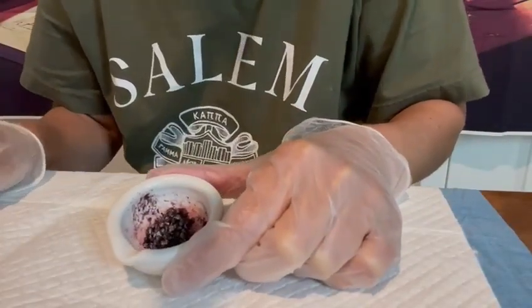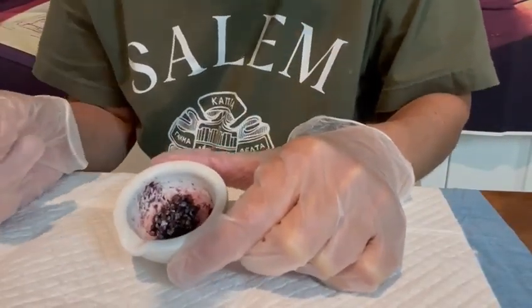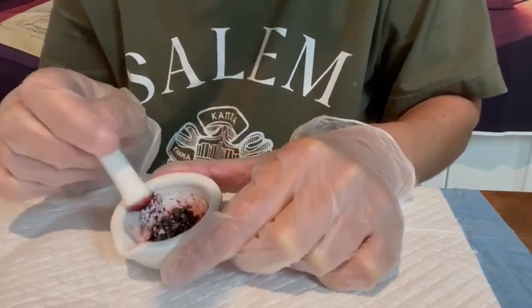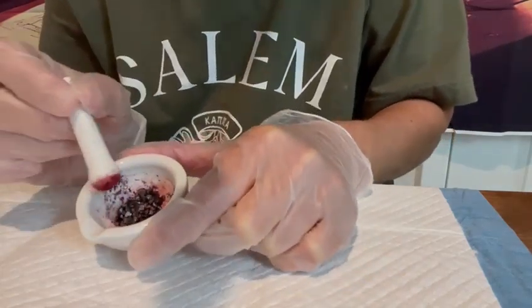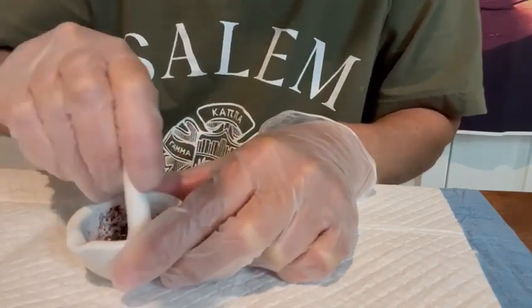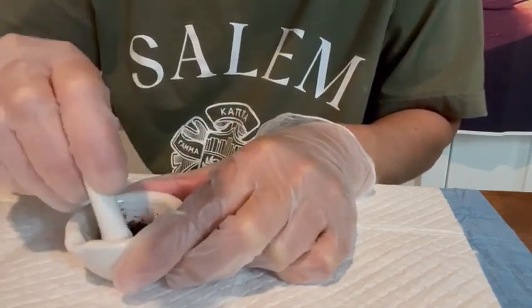So to start making our dye, or extracting the pigment out of the cochineal, we'll put some of the dried insects into the mortar and we grind them softly with a pestle.